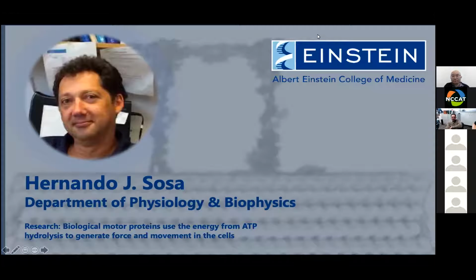I started doing some EM there, mostly sectioning and classical EM. At the same time, I was looking at papers, and getting the structure of any of these cytoskeletal proteins was the holy grail to understand at the atomic level how these molecular machines work.